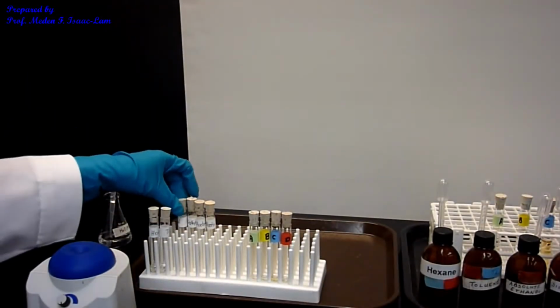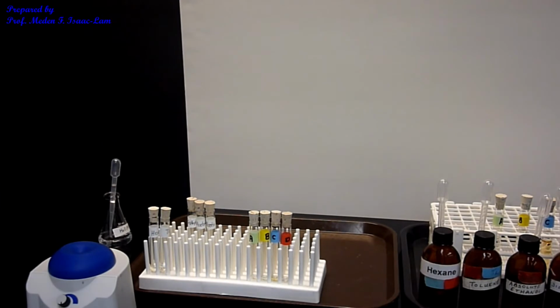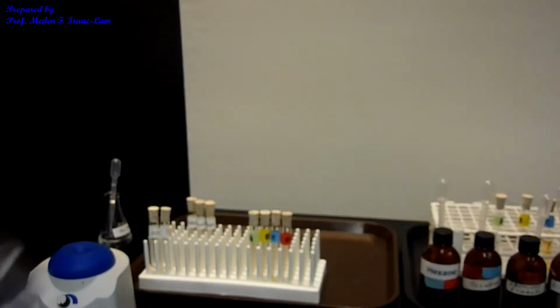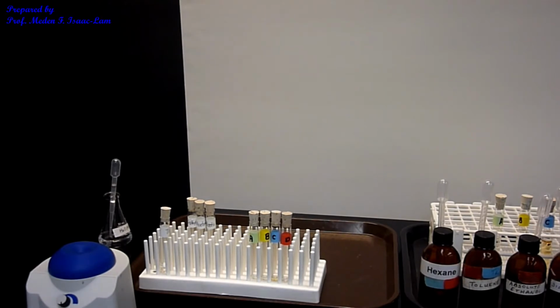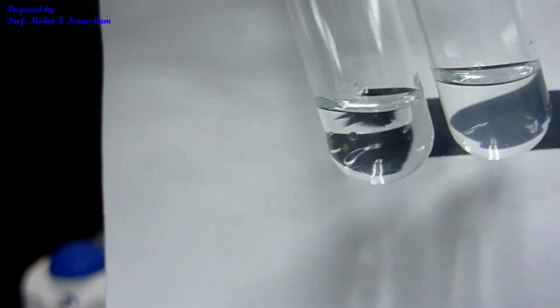And ethanol sample. If you compare hexane and ethanol, hexane is on the left. The behavior of hexane and toluene are actually the same.